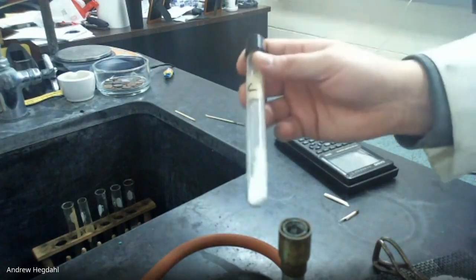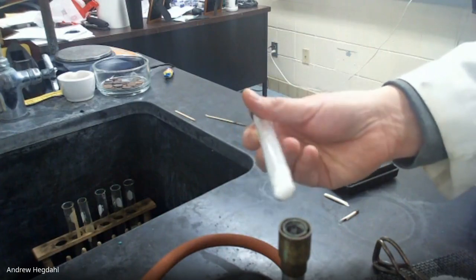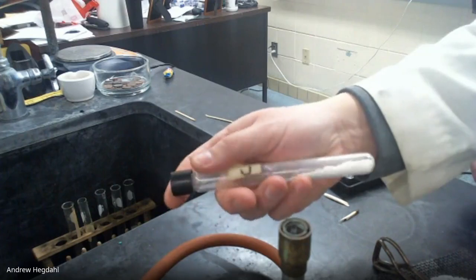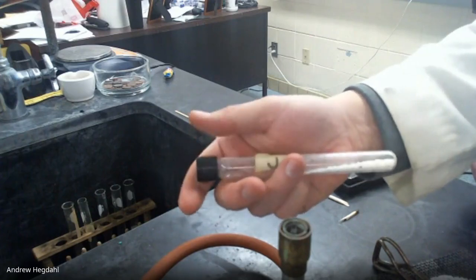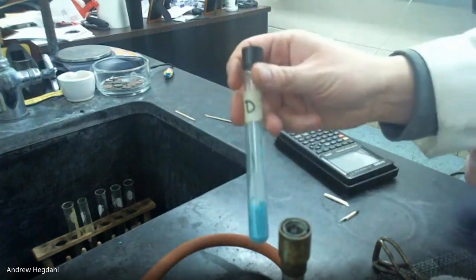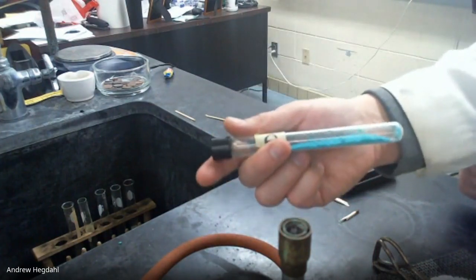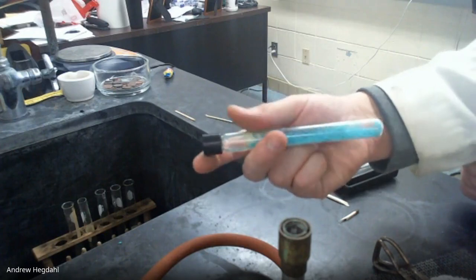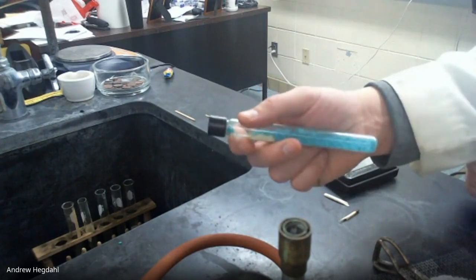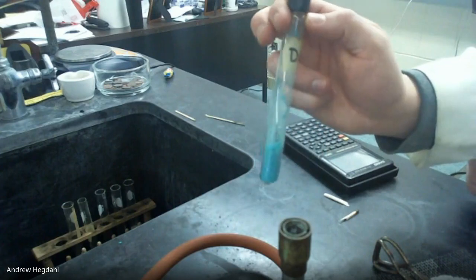C is similar to B. I think it's more like a powdered sugar. Okay. D is a really easy one to distinguish. Blue-green crystals. And when you see these in person, the crystals are kind of long and sharp. Long, sharp, blue-green crystals, letter D.